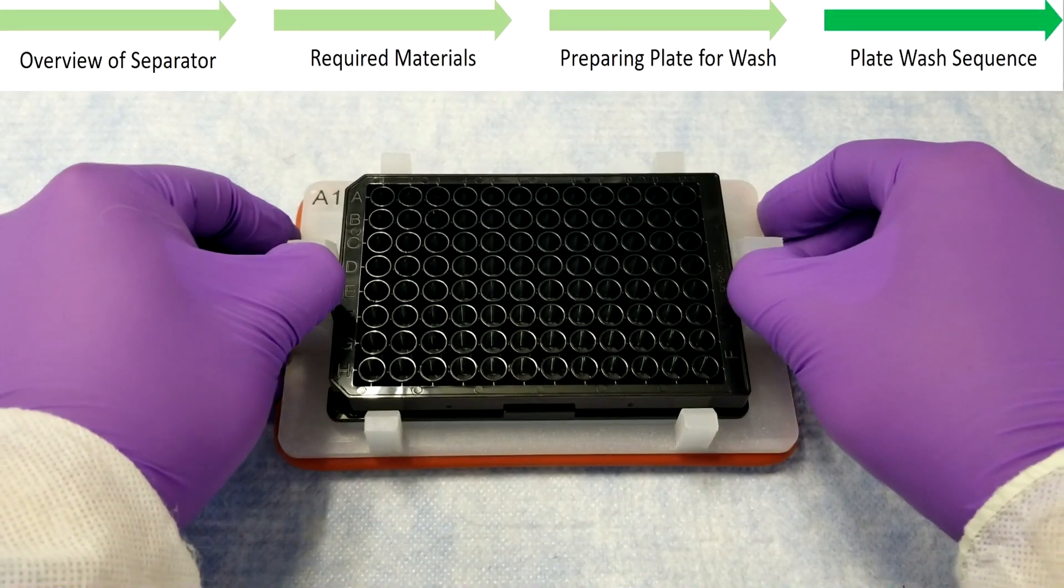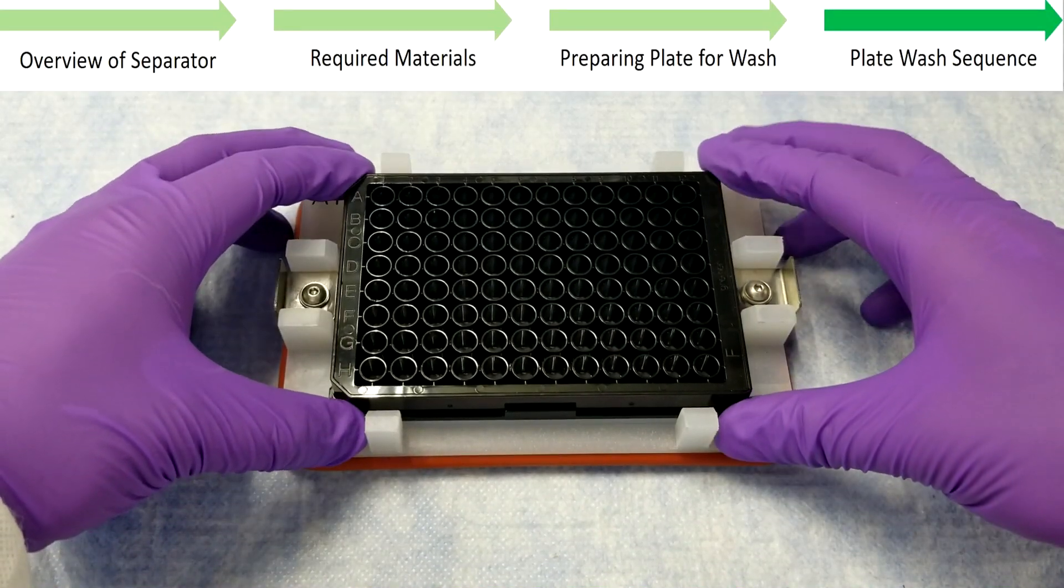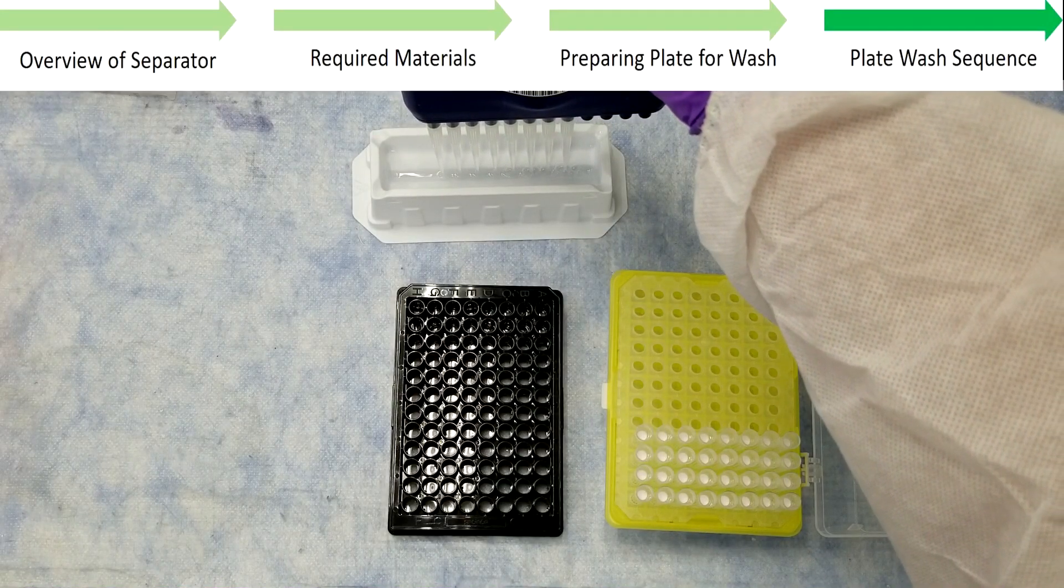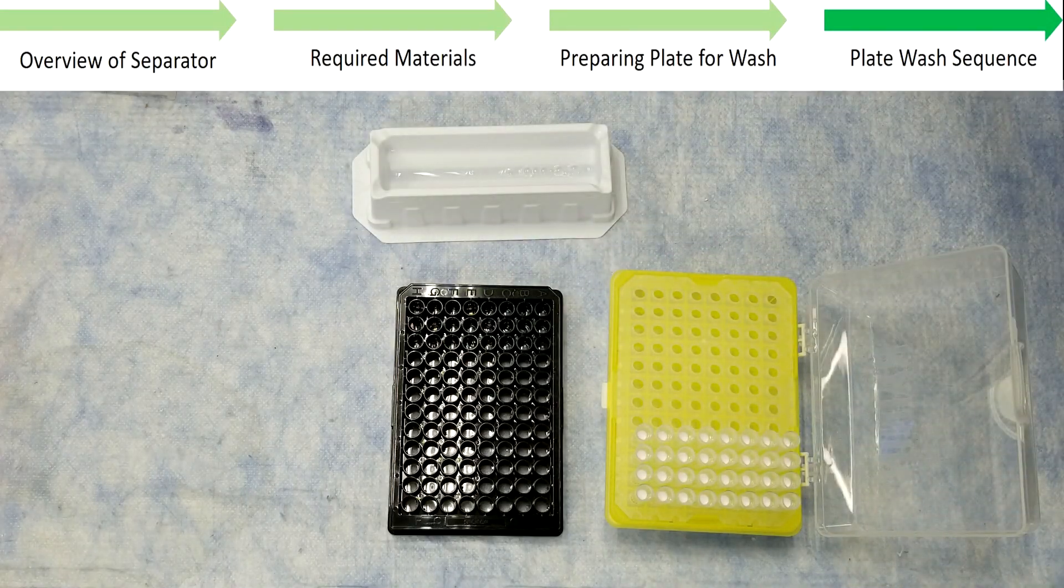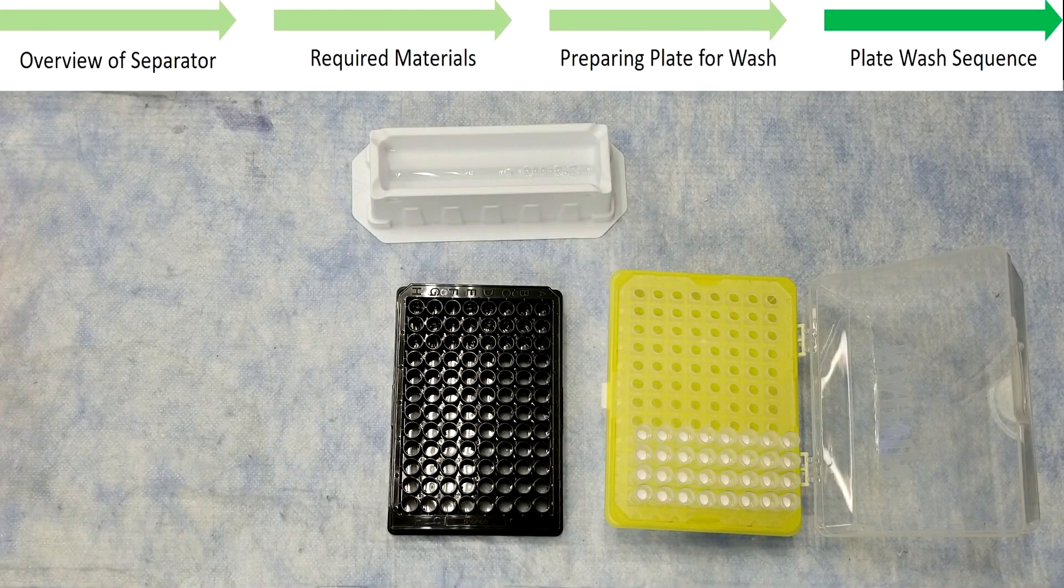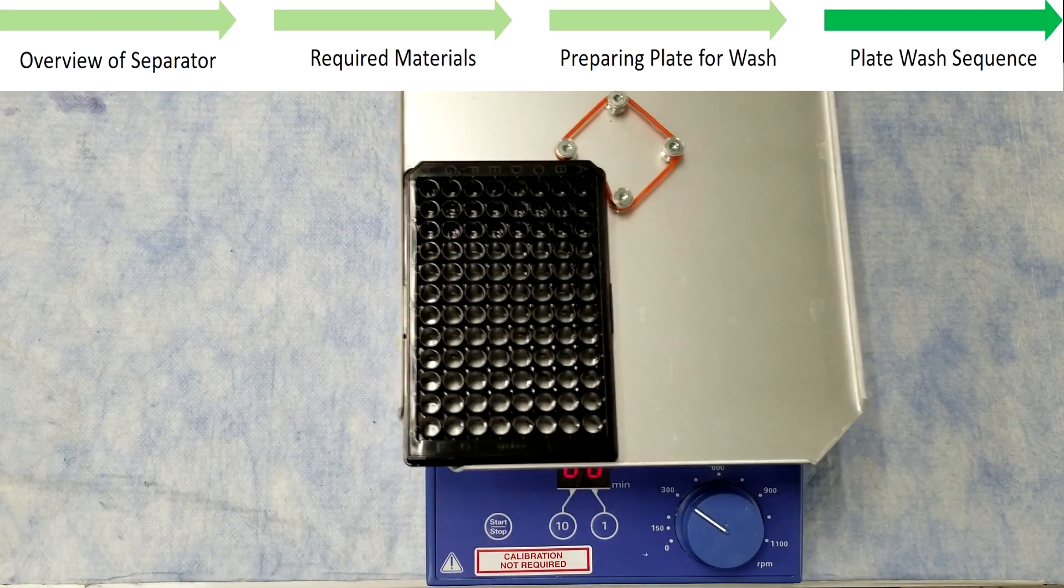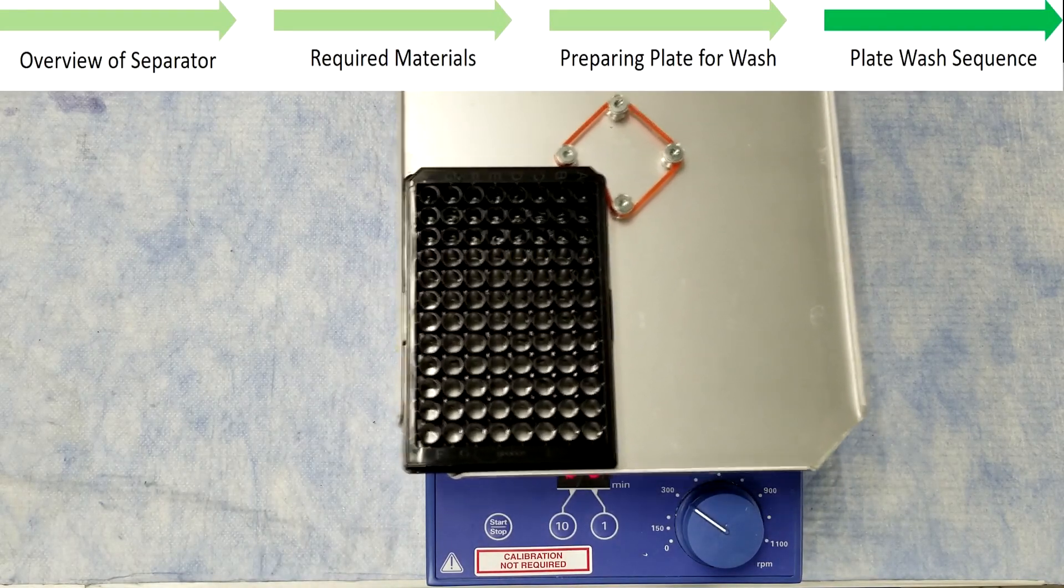To begin the wash cycle, remove the plate from the separator by unlocking the latches, and dispense 1x wash buffer from a clean reagent reservoir into the assay wells, using fresh tips each time. Shake the plate at 300 RPM for 30 seconds to circulate the beads with the buffer. Ensure that no spillover occurs between wells.